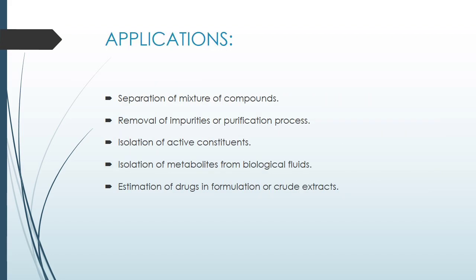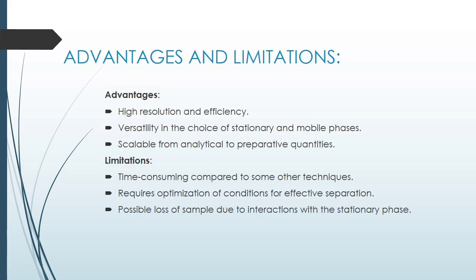Applications. The applications are separation of mixture compounds, removal of impurities or purification process, isolation of active constituents, isolation of metabolites from biological fluids, and estimation of drugs in formulations or crude extracts. The next slide, advantages and limitations.